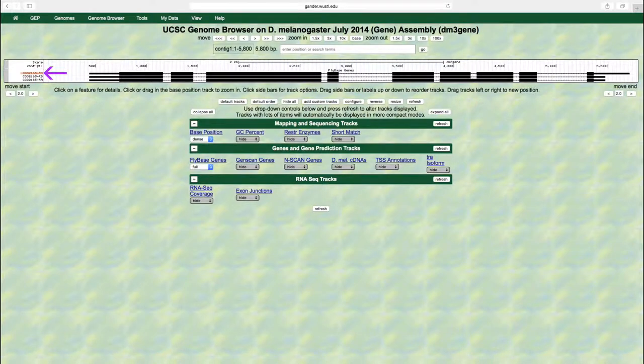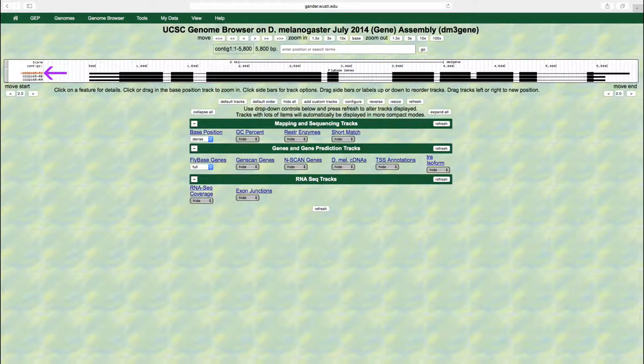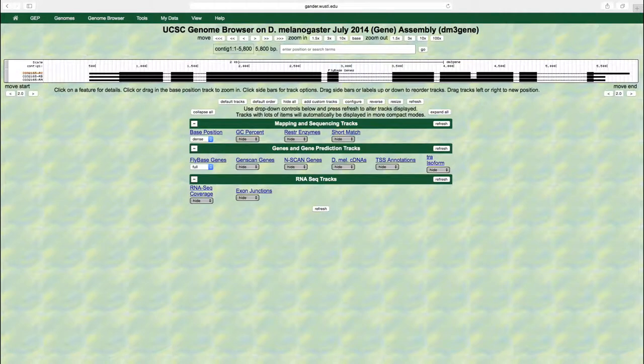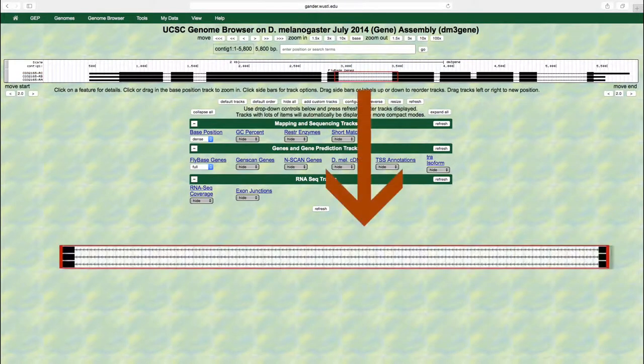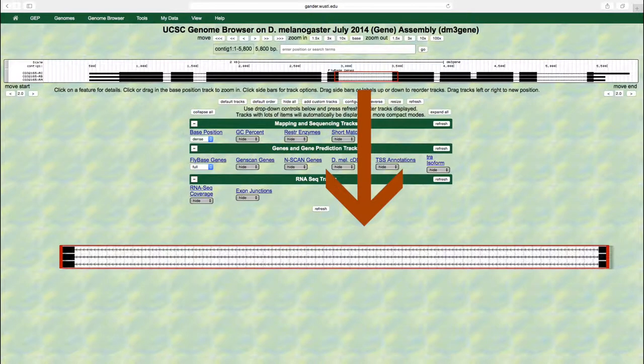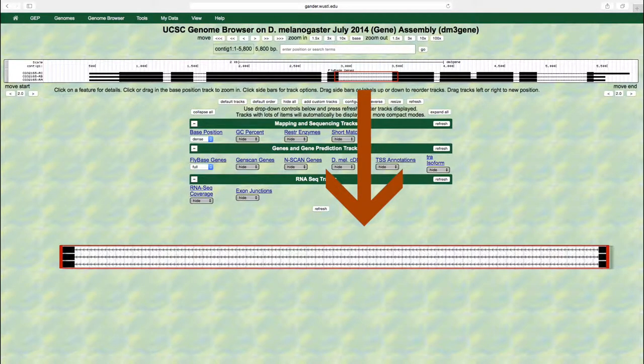The arrows within each intron denote the orientation of the gene relative to the contig. Because the arrows point from right to left, CG32165 is on the complementary strand. This means that the first transcribed exon is located at the right side of the image.